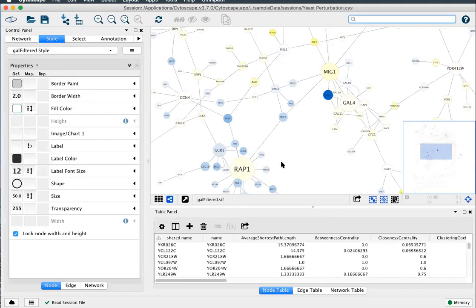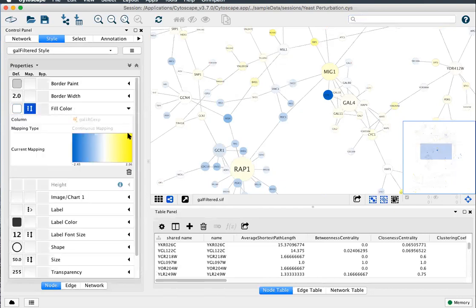First we'll want to clear the current node styling to start with a clean slate. Let's clear the fill color, expand, delete.